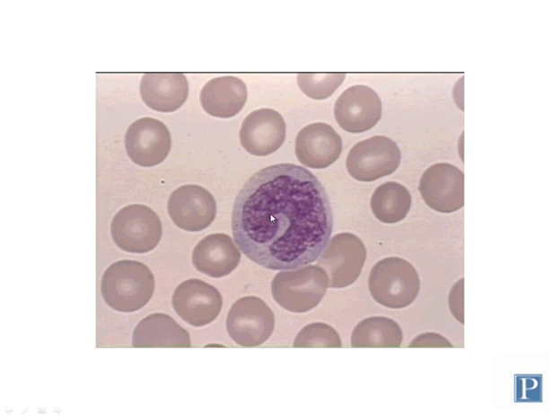Also, the nucleus of monocytes is more irregular in shape instead of being perfectly spherical. They are either irregular in shape or oftentimes have this classic horseshoe shape. So that's very different from lymphocytes. Additionally, monocytes have much more abundant cytoplasm, so you can see a lot of cytoplasm here, not just a very thin rim as you see for lymphocytes.